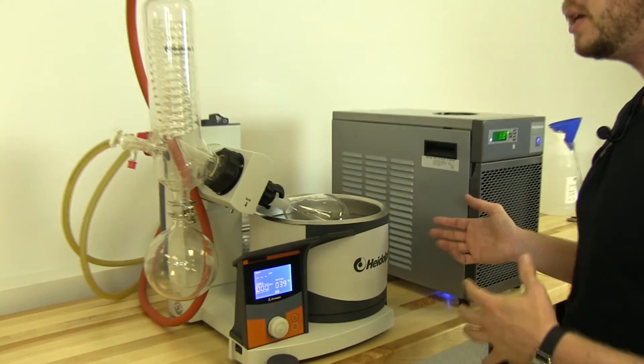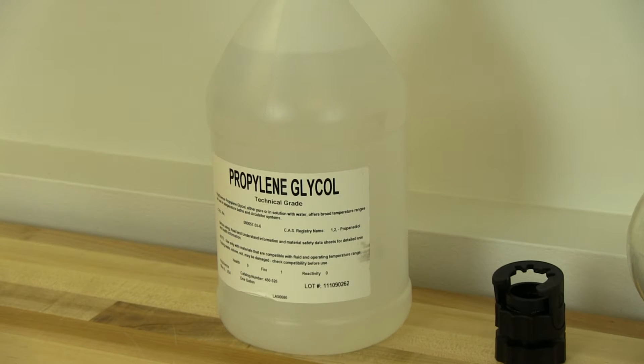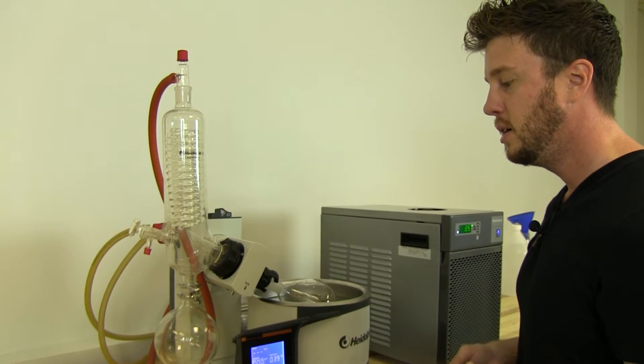Propylene glycol is a food safe antifreeze. It's found very commonly in cosmetics. It's also found in things like windshield washer fluid, plane de-icer. It's safe for the environment, non-toxic, food safe.